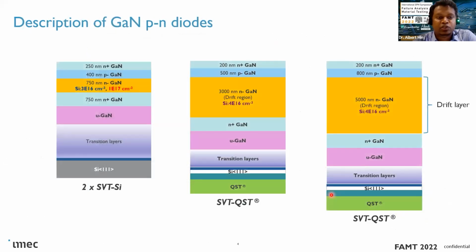There are two ways to look at them. One is to go through the cross-section: we take a device structure, go into the cross-section, and measure it there. Or we can go from the plan view. But of course, then we need some dedicated structures, and these dislocation lines will look more like zero-dimensional defects.